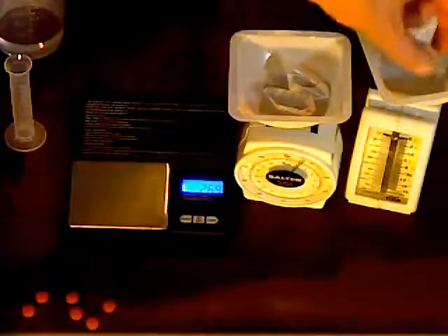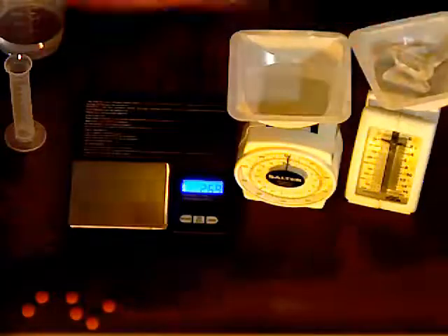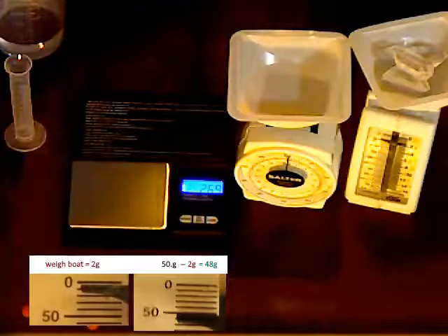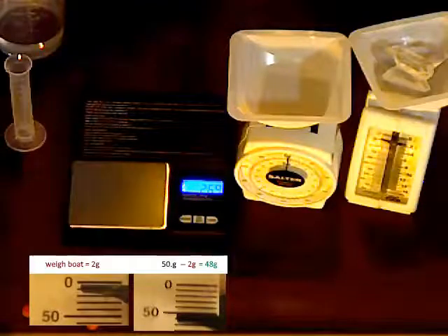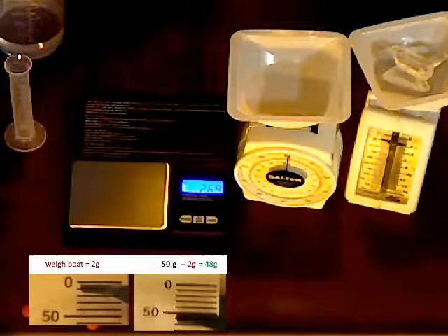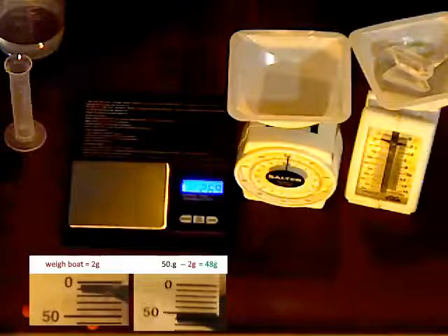I'll try the scale that's in increments of 10. It does move, not by much, but it does move. Once I put the 3 crystals on the scale that reads every 10 grams, we find that it goes from about 2 grams with the weigh boat to 50 grams. And when I subtract those, I get 48 grams, the measured mass of the 3 crystals combined. Mass depends on the amount of substance.